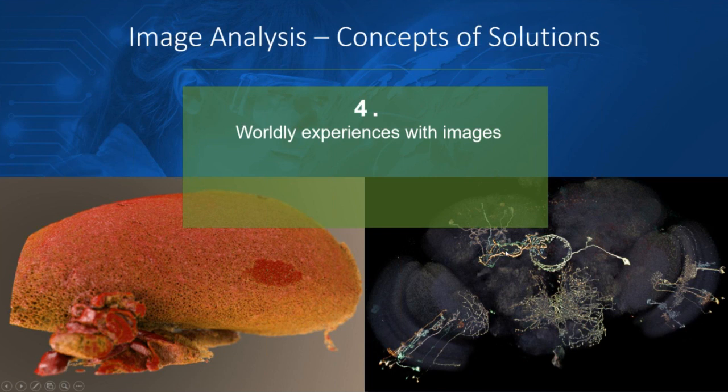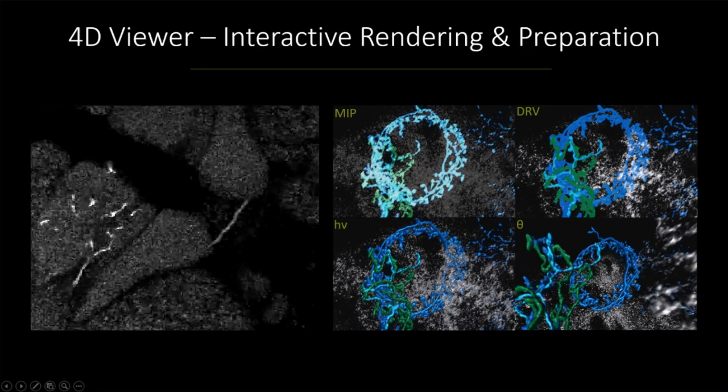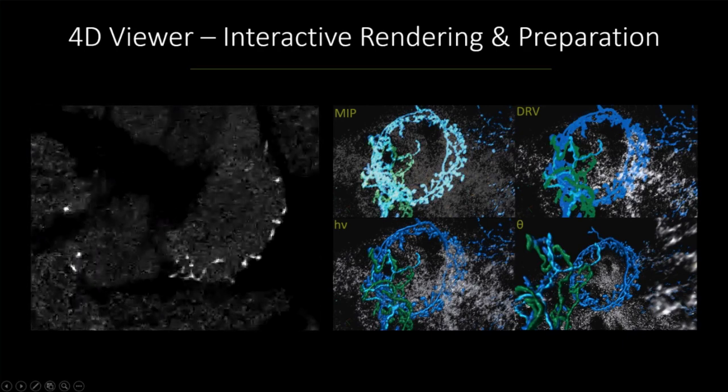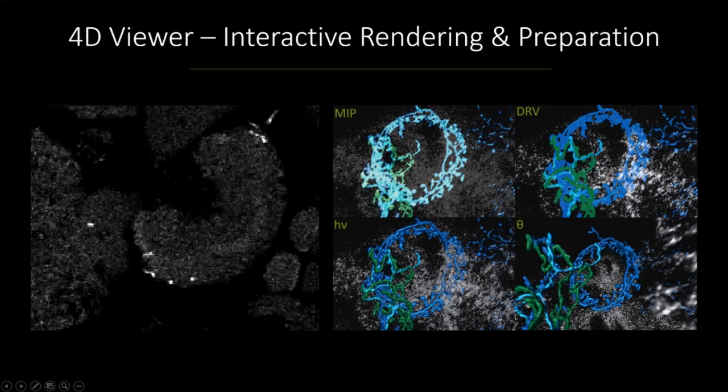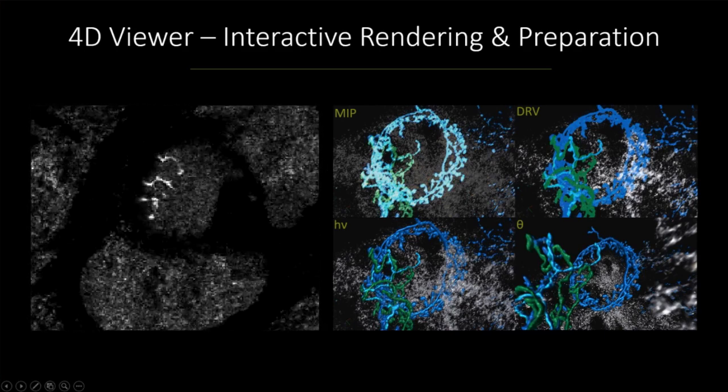And I think this provides us with more information about the image and can really help us to decipher the three-dimensional spatial relationships between the objects in the images. Here's a quick example: here's a bunch of 2D slices, and here's what happens when we begin to make various kinds of projections of these 2D slices.